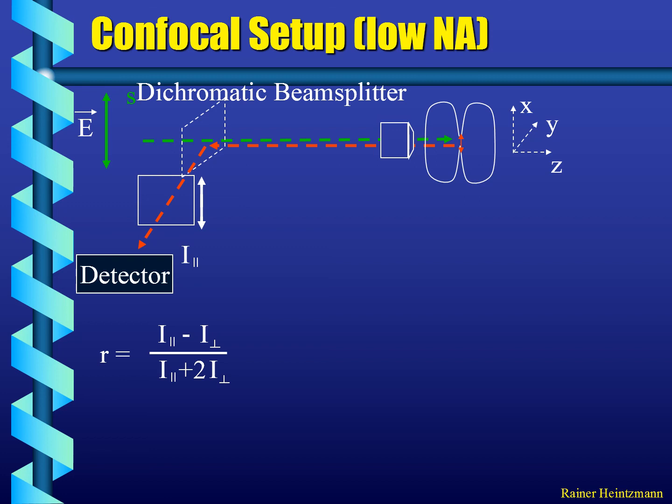If we work out what happens there, the problem is that the dipole is not able to emit when it is in the Z orientation. If the dipole sits along Z, then it would have zero emission along the direction of detection. Yet they do, of course, emit, because a diagonal dipole will also have the possibility to emit in this direction, but we cannot see it.